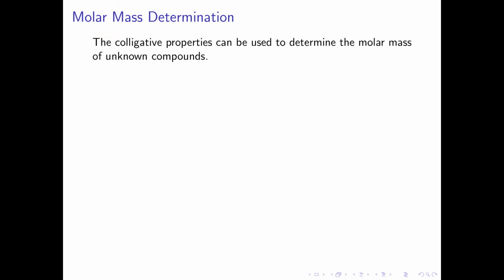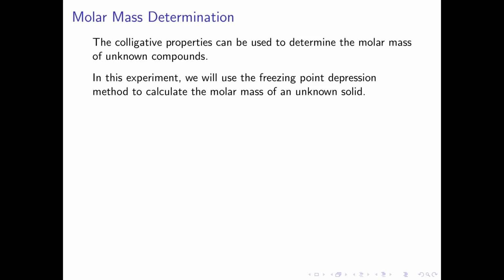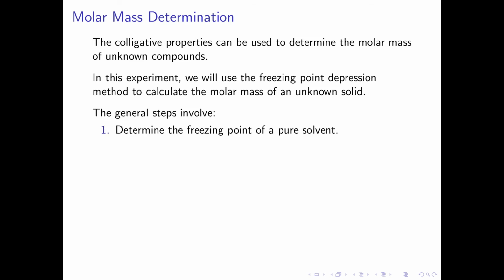The colligative properties can be used to determine the molar mass of unknown compounds. In this experiment, we will use the freezing point depression method to calculate the molar mass of an unknown solid. The general steps involve the following.